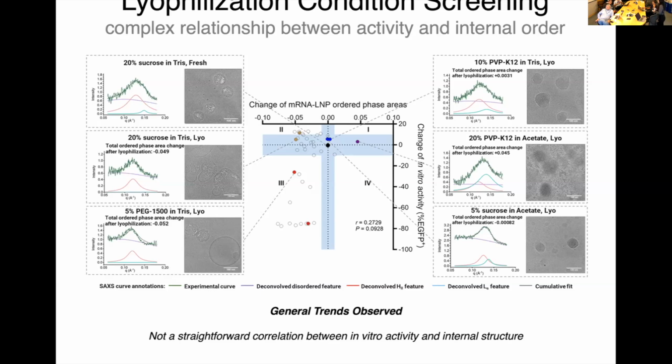And these weren't live mouse studies; these were just a cell-based study. But again, when you inject this stuff into your body, everything changes, right? So we can characterize up to a certain point in terms of efficacy. Yeah, no, thank you for the question.